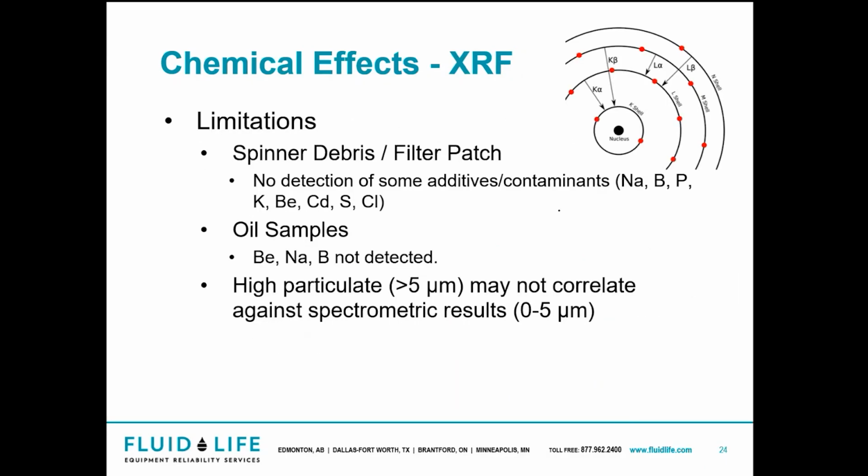So XRF, I touched on this though. This is going to be used for larger contaminants, and that's going to be the same thing when it comes to the SEM. It's going to be for larger particles that we're going to be testing.